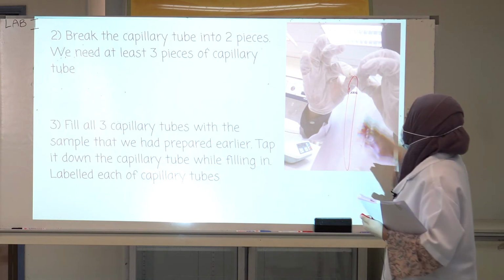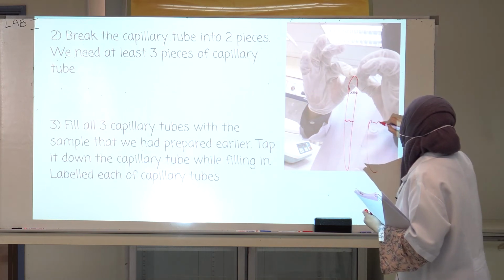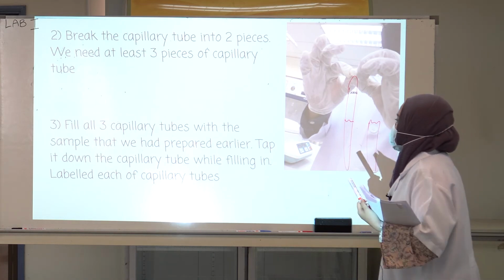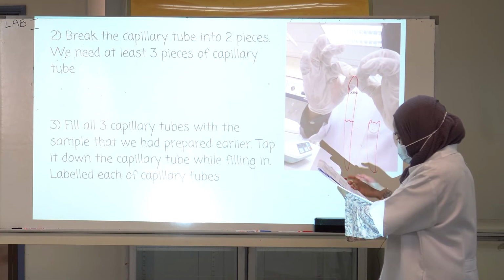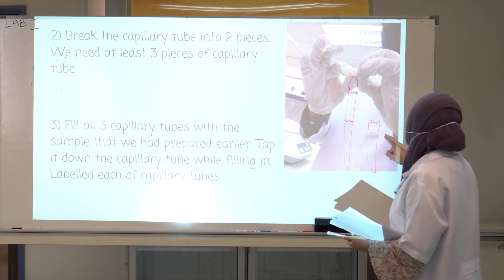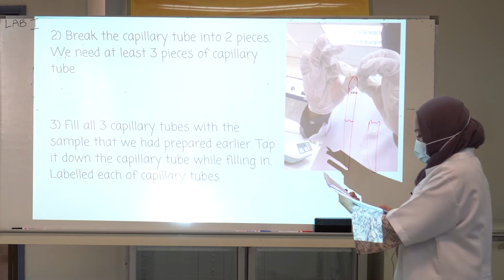It's more long actually, so we have to break it in half, and it will be like this. Yes, like this. And we have to break it like this, and make sure the capillary tube is high enough to be inserted in the tube of the melting point apparatus.